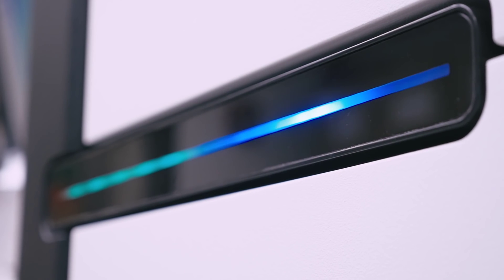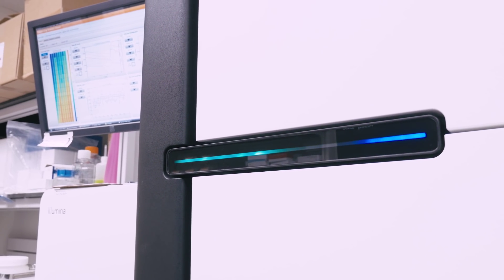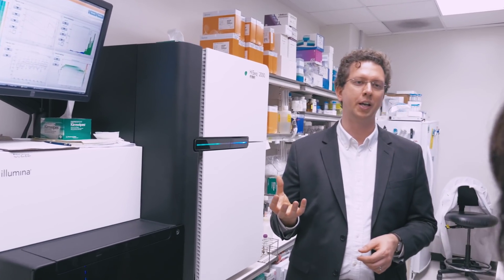Okay, so this is the third step of single cell sequencing. It's the next generation sequencing part. This is one of the runs that's going on right now on the Illumina machine. If we sequence the whole genome of a single cell, we'll be getting back about a terabyte of data from each cell.